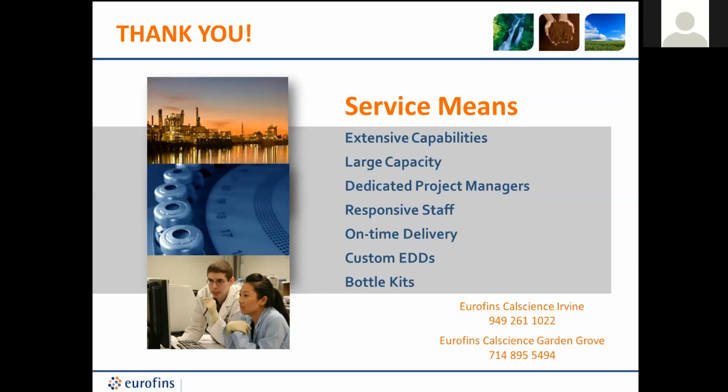In our stormwater training, one of the things we tell our clients is to try not to flush out your preservative. For example, oil and grease. Most labs use hydrochloric acid, some use sulfuric acid solution. By the way, out of curiosity, which do you prefer, HCl or H2SO4? It doesn't really matter. We normally provide hydrochloric acid here.